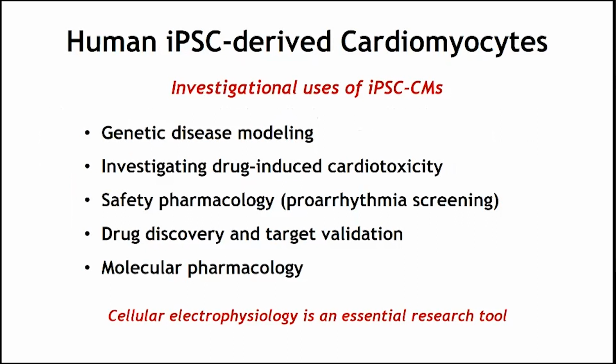And why do that? This has been really an area of intense investigation over the past few years. I think most people have used this technology to model genetic diseases of the heart, and others have used it to investigate drug-induced toxicities, including proarrhythmic screening of drugs for safety pharmacology. And there's been some progress in using them for drug discovery and target validation. We've also used this to really explore the molecular pharmacology of some novel sodium channel blockers, and that's going to be something I'm going to talk about today.